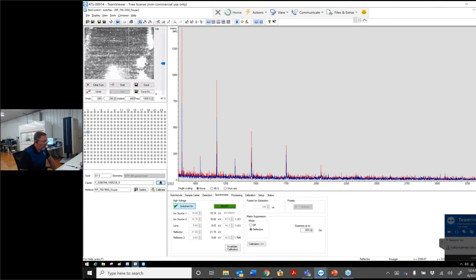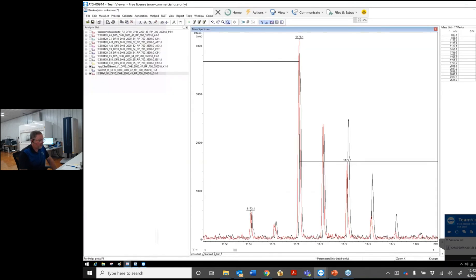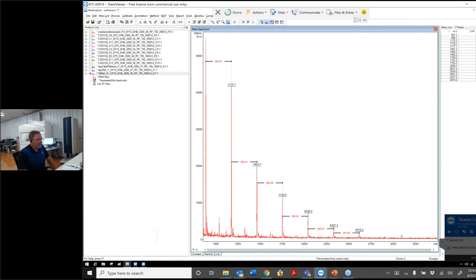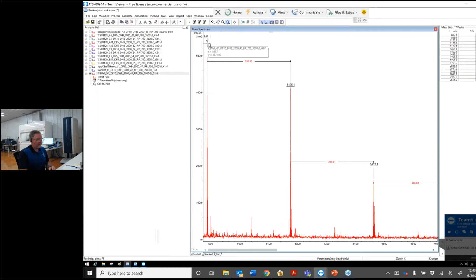Now I'll transition into the FlexAnalysis window to show the data set acquired earlier today. In FlexAnalysis, we can take the acquired data and inspect it — including labels, signal-to-noise, and absolute intensity of the peaks of interest. Looking at the cranberry reference material, we can see a polymer distribution. Zooming in, we see the trimer and a mass difference of 288 units to the tetramer — that's the mass of an additional catechin unit. Going from tetramer to pentamer, the mass increases by another 288 atomic mass units.